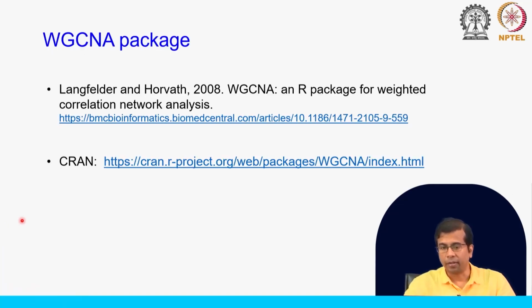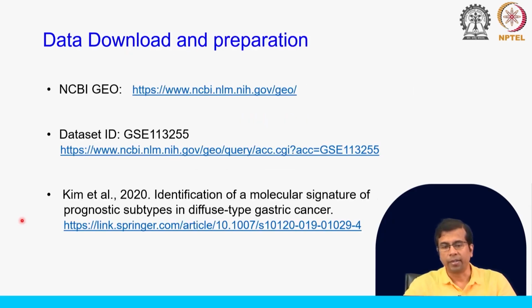Here is the reference again to the WGCNA package, and I'll show you in a moment where you can find this package, and the manual for this package, with the functions that you can use. The data that we will be using is data from NCBI GEO. The data set ID is given here, and this data set is from this paper. Again, the reference to this paper is given, so please feel free to go and read this paper for more details.